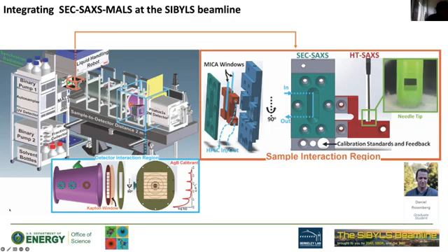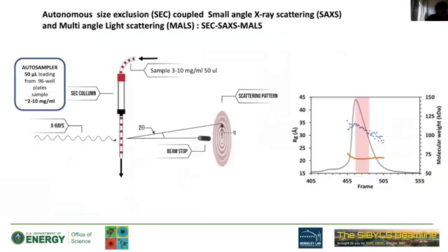This was just mentioned, how Craig is collecting or recollecting high throughput SAXS using this needle/sample cell. We developed a stage that SEC-SAXS is part of, and the flow cell is built not from the capillary, but from a mica window to lower the background. These are technical details that I don't want to go into now. Obviously, thanks to Daniel, who will work on this.